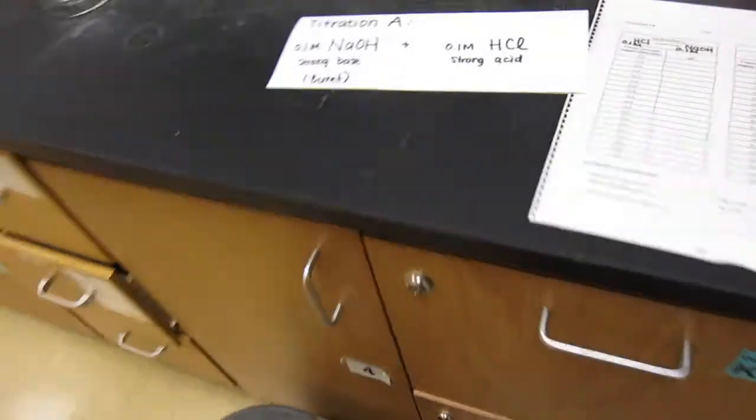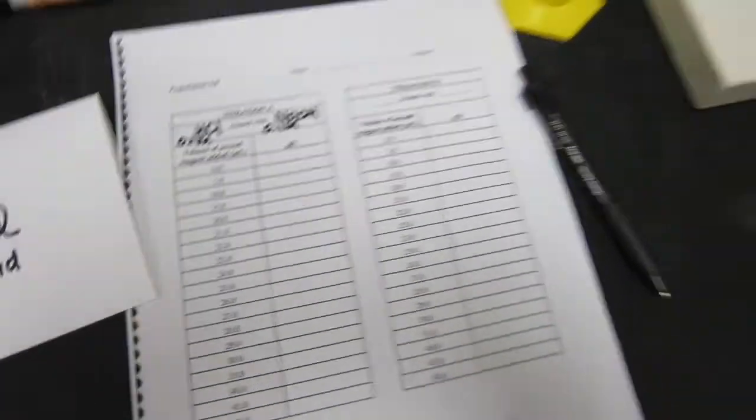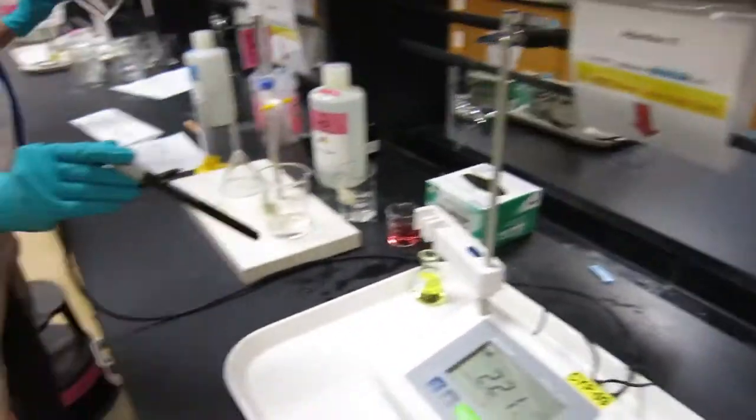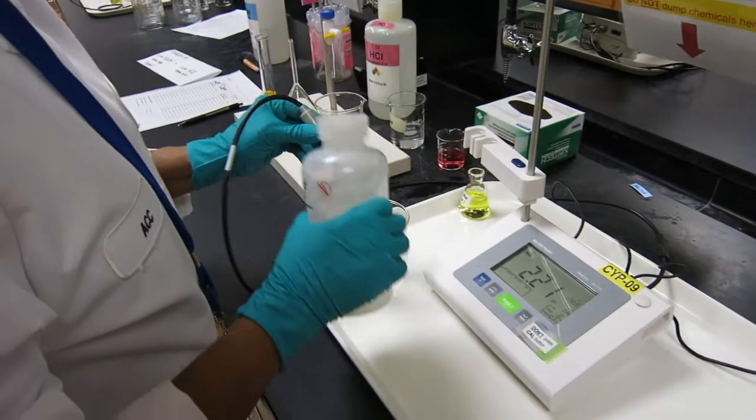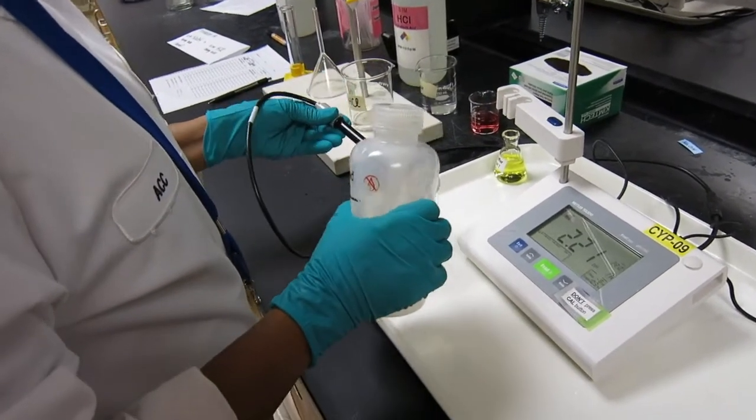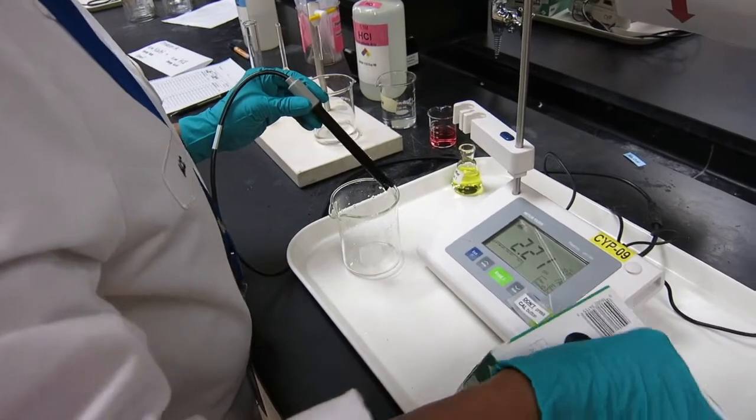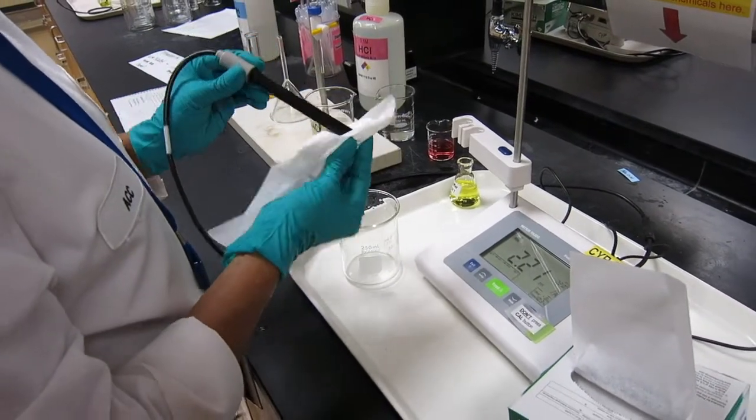Now we're going to start the titration. Here's the form. We're going to rinse the probe first and clean it up before we start.